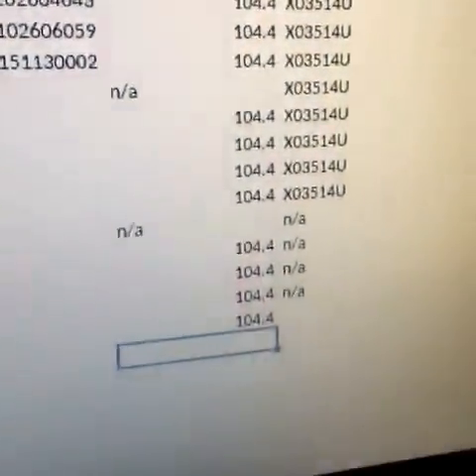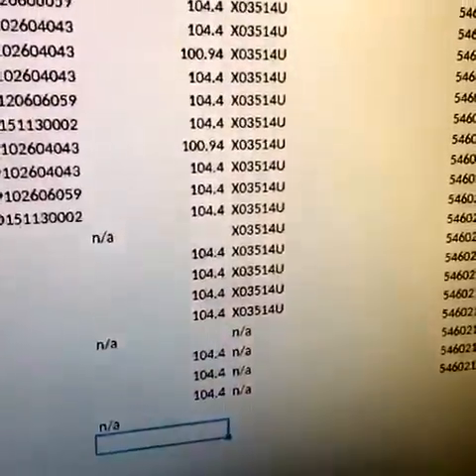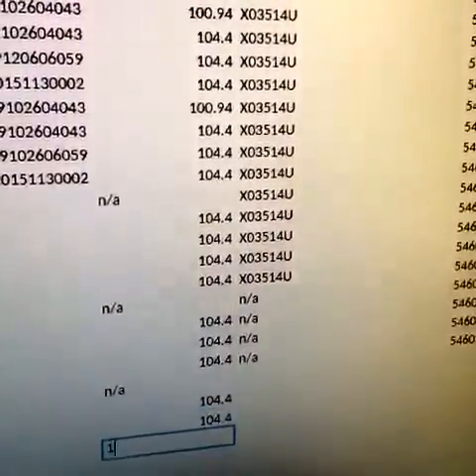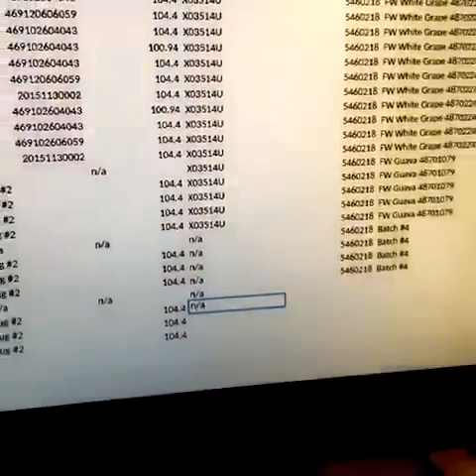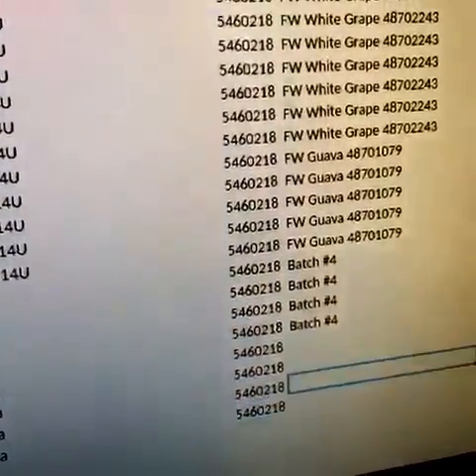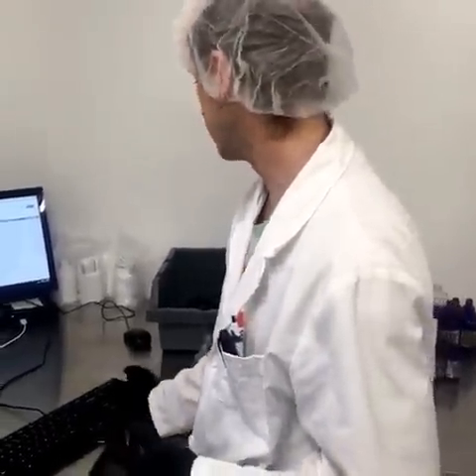So as long as it's between 105 and 95, we are in an acceptable level. Do you make adjustments on the recipe itself because it's 104? No. If it were to ever come out at 108 or 109 or something high like that, then what we would do is add VG to the jug of nicotine, spin it down a little bit, and then retest it until it comes into an appropriate level.